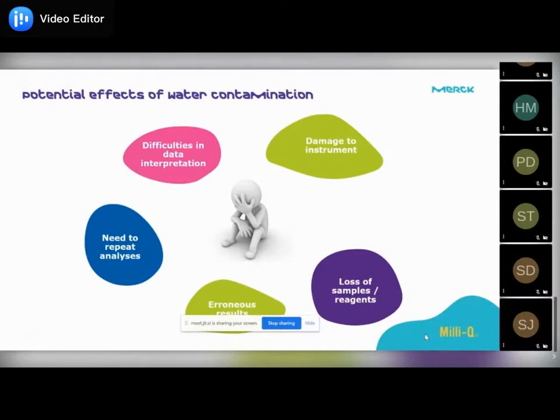Sometimes you will not be in a position to get a healthy amount of the sample, which will also be a big problem for you. And even if sometimes you get some results, it will not be assured that the results you are getting are exactly right. So this is a major problem which may come from the water. So we now understand the various contaminations of water and the possible consequences of water contamination. It holds good for all kinds of applications.